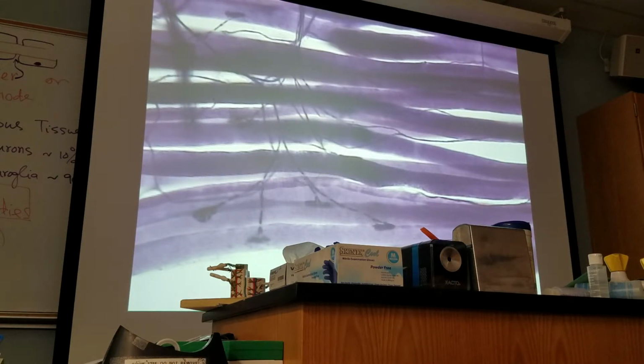Clear? Does the synaptic end bulb ever make contact with another axon? This is a part of the axon terminal, the end of the axon. But does it ever touch another axon?